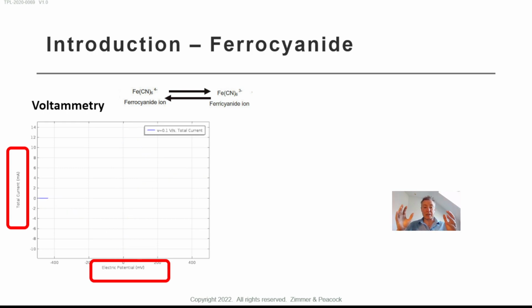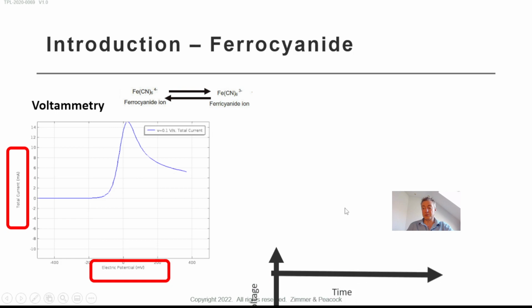We're going to keep coming back to this in several ways, so I think the repetition will help with the understanding of it. But this is one of the classics. If people were to have an iconic image of electrochemistry, at least analytical electrochemistry, it's probably cyclic voltammetry, and often you'll have these kind of voltammograms used.